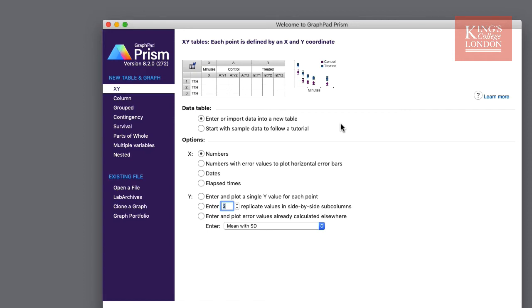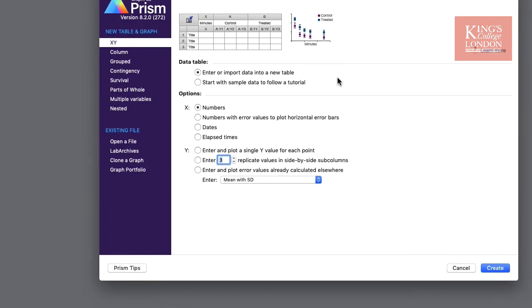Beneath the data tables are a list of options. These options will be particular to whichever data you are trying to enter. For instance here with our XY graph we have four options for X entry and three options for Y entry. They include numbers, numbers with horizontal error bars, dates and times, and for Y we can choose single, multiples or simply enter mean plus or minus your standard deviation or standard error.